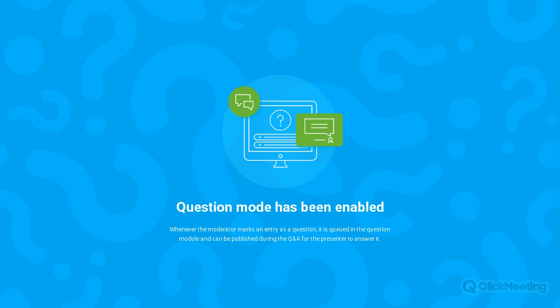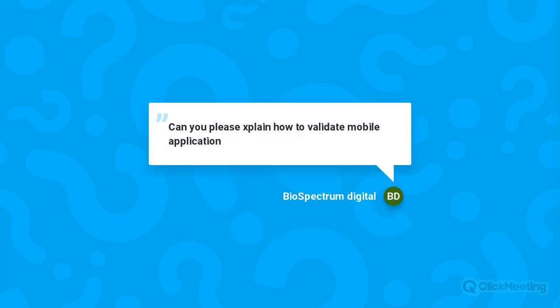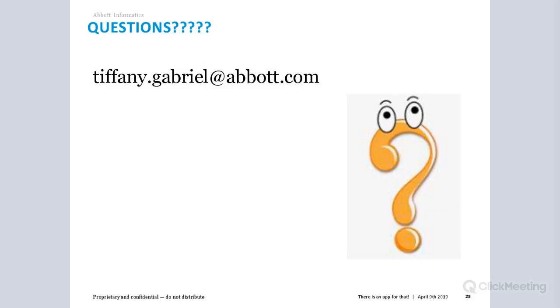The only difference would be how you would validate the out-of-the-box applications versus ones that you've made yourself using the custom designer. For the out-of-the-box applications, you would have a validation plan and perform your user acceptance testing. But obviously, anything that's custom made and designed yourself would require more rigorous validation.